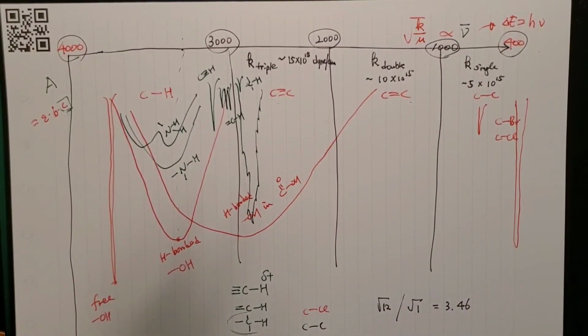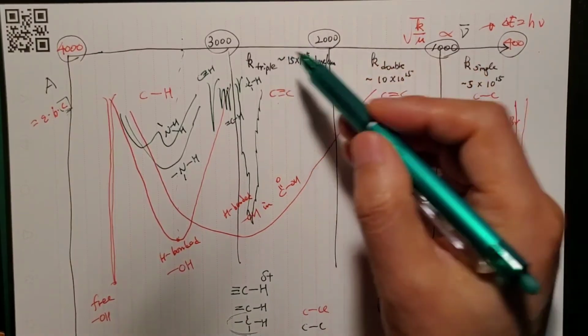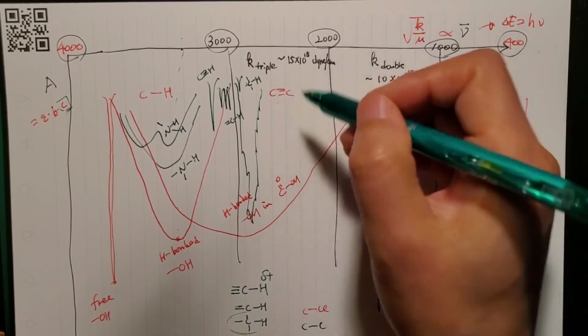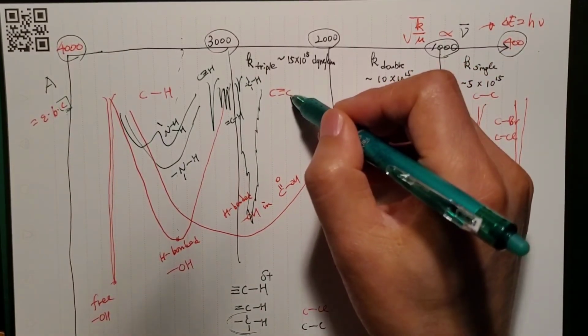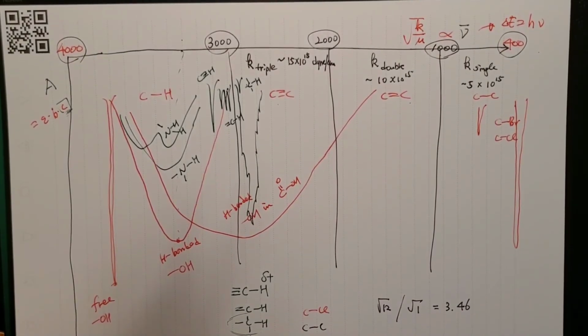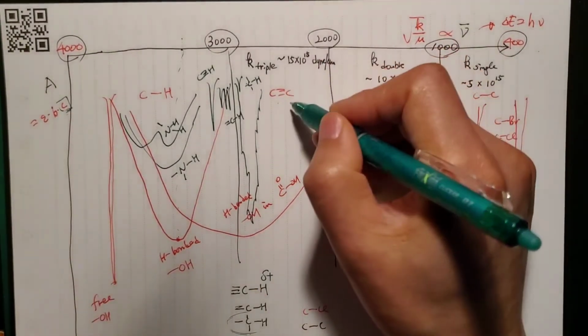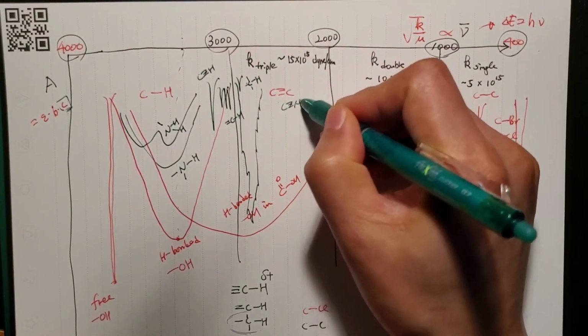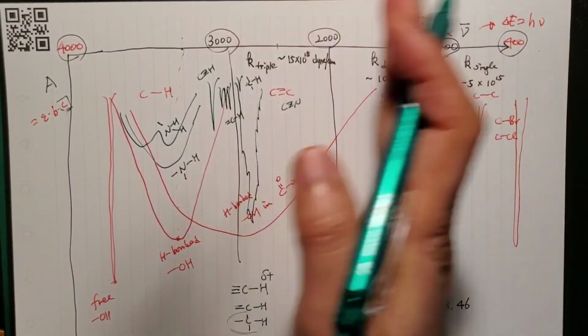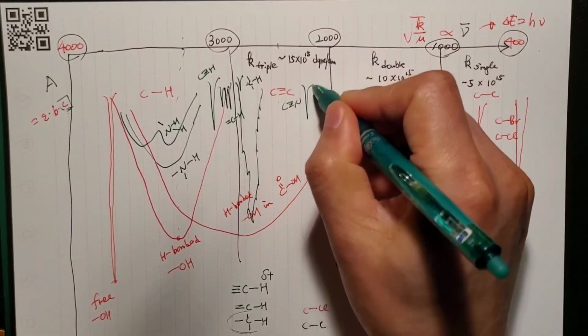All right, what are the typical triple bonds that come in this box? You don't see many triple bonds in organic chemistry. You have a carbon-carbon triple bond, and a carbon-nitrogen triple bond in the cyanide, the nitrile group. That's it. Both of them show a signal, not even at 2500, more to this side, like this.